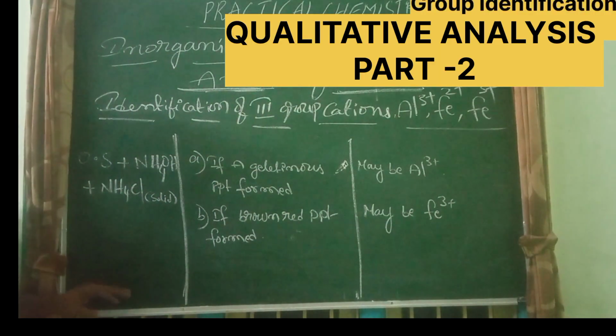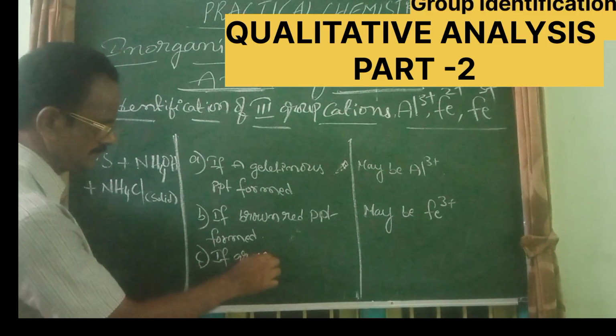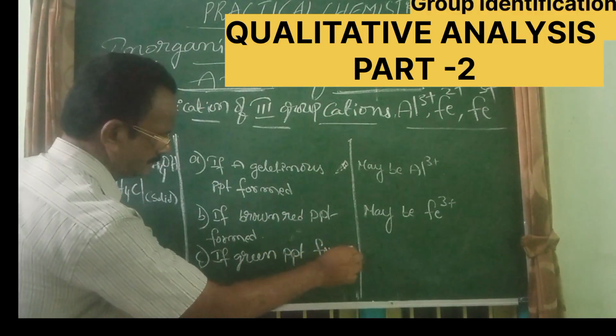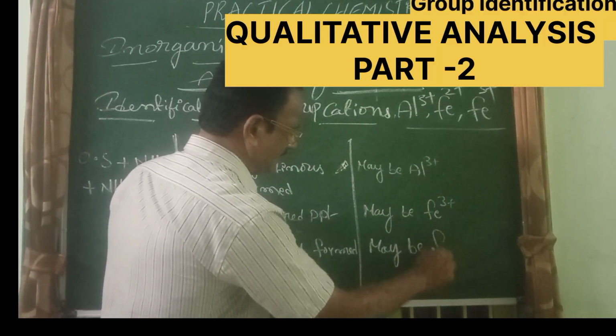If green precipitate formed, maybe Fe2+.